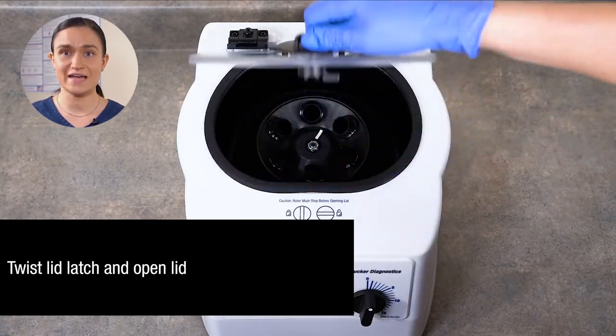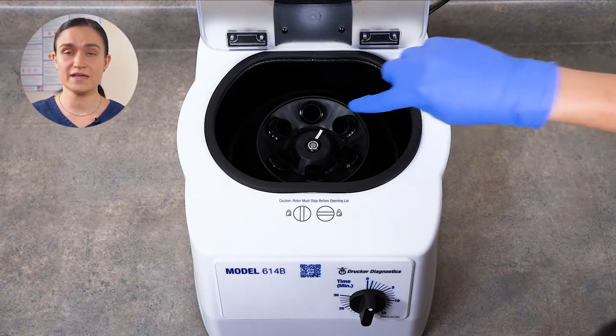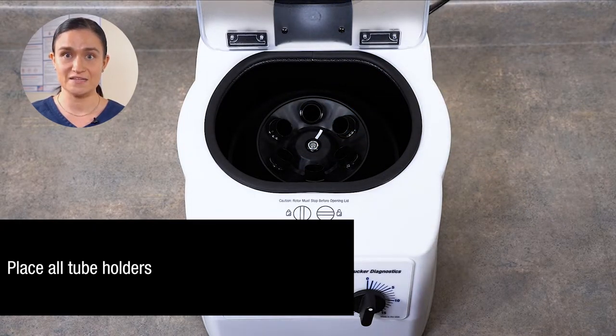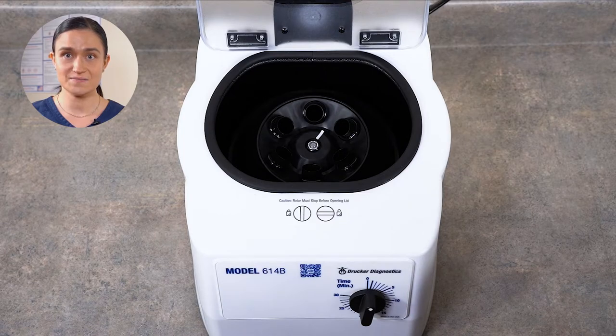Now we can twist our lid latch and lift the lid open. You can see our rotor here inside. Your 614B comes with its rotor and black tube holders installed and ready to run. You will need to place all 6 tube holders any time you run the centrifuge, even if you are not spinning 6 tubes. Properly seated tube holders can be moved slightly in their slots — this is by design, as that's what allows them to be easily changed. They do not click or snap into place. Your 614B has only authentic Drucker Diagnostics parts, including the rotor and tube holders. You should only use authentic Drucker Diagnostics parts in your centrifuge, as anything else may damage your centrifuge or even be dangerous.